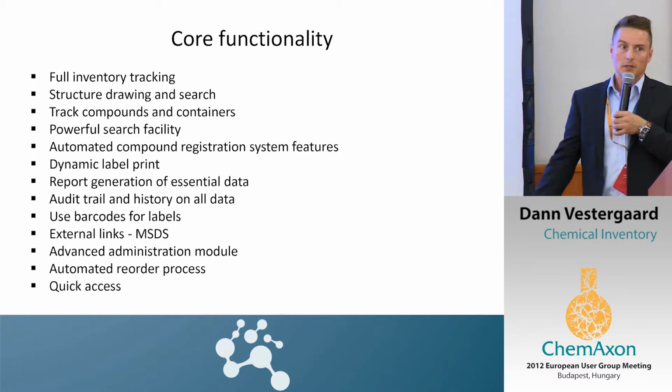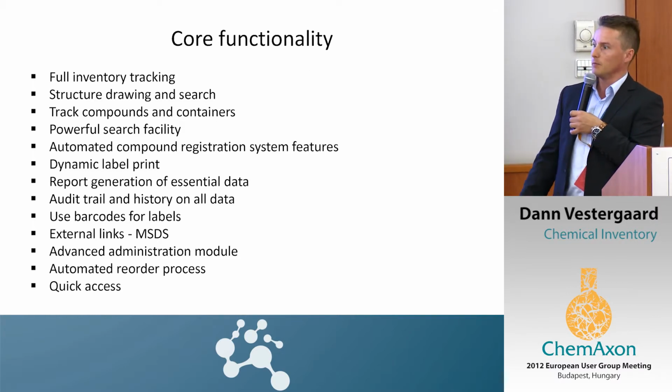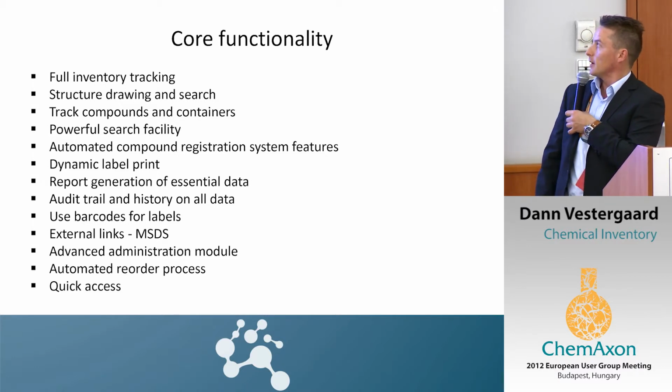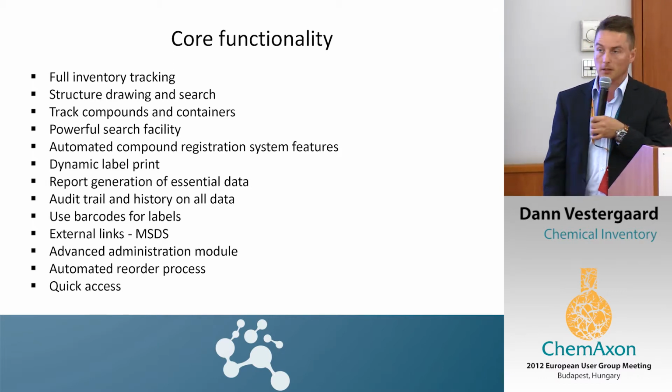You have report generation for the entire system, where you can get a list of containers when you need to present that to government officials or whoever would be interested. Audit trail on all data. Barcode is of course supported throughout the application.